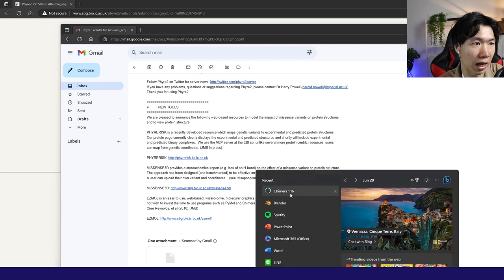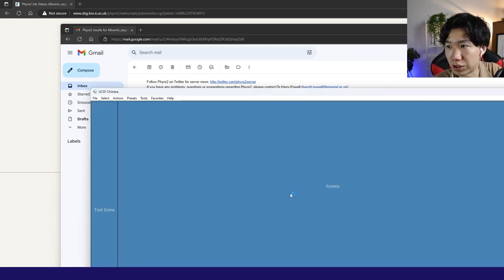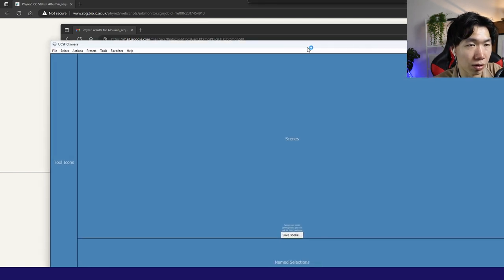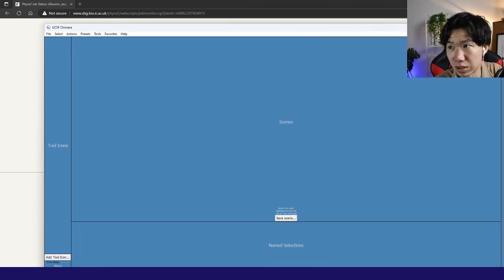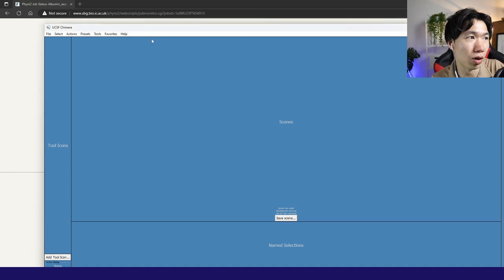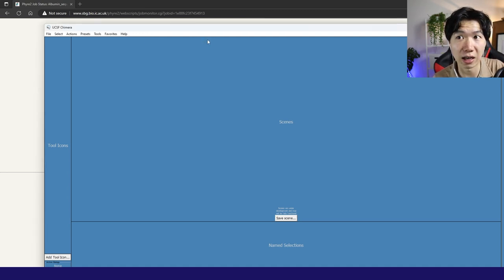That's open Chimera. This is also a free software that you can download from University of San Francisco. With Chimera, you can open PDB file. PDB stands for protein data bank.